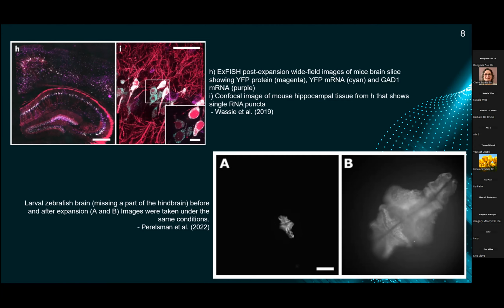And then for those of you who are maybe interested in studying developmental biology or work with zebrafish, you can also expand the whole larval zebrafish brain, which I found was actually pretty cool. So this image was taken under the same conditions, just to show how much bigger your sample becomes.